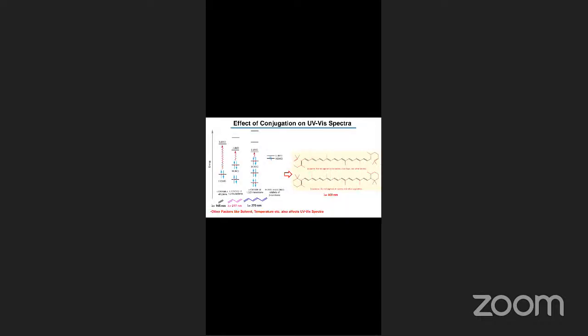If all our chromophores absorb at the same wavelength, then you will not be able to separate them because they will overlap. But if they have different polarity, then they will separate in the column, okay? So with this premise, there are a few terminologies you might have seen, like hypsochromic, hyperchromic shift and all that. I don't want to go too much into them. It is just giving you a little bit more idea about the UV, which I don't want to put too much understanding into.